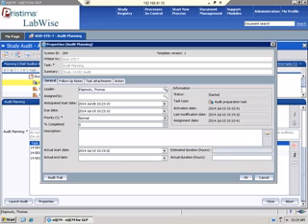Okay. The estimated duration of this audit, say 16 hours. And then once it's finished, you'll get the total. And so you can get a comparison of, it was supposed to take 16, it took 22, or it was supposed to take 16, it took 8. And then there's also an audit trail on any of the metadata of the properties of the audit.